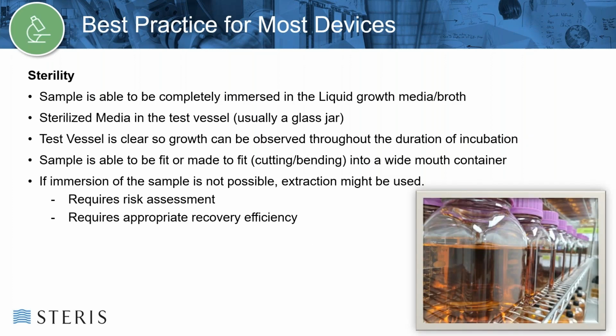Sterility best practices: the sample should be able to be completely immersed in the liquid growth media or broth. These sterilized media are contained in the test vessel we intend to use for that test, which is usually a glass jar. The test vessel would also preferably be clear so that we can observe for growth throughout the duration of the incubation, which is 14 days.